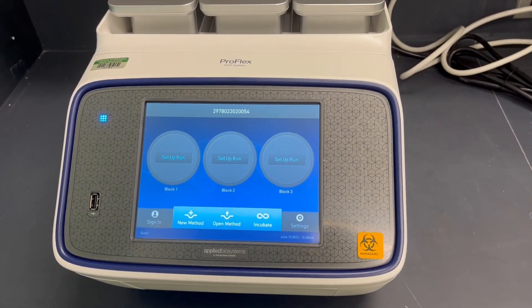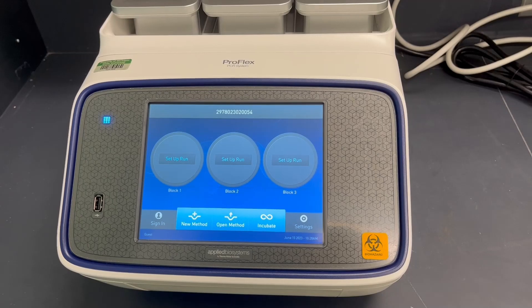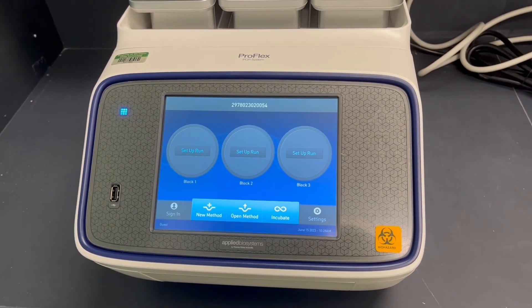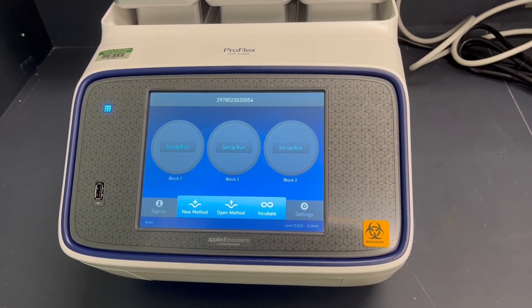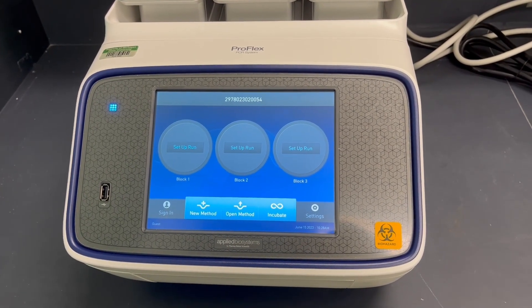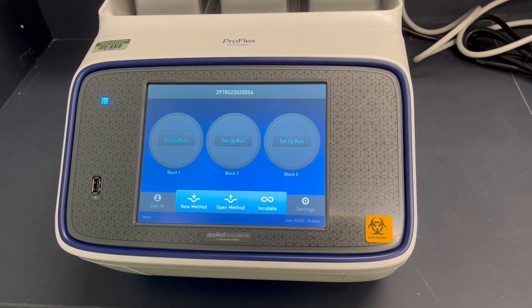Let us know if you need any help — we'd be more than happy to assist with protocol editing features if you need support. These thermocyclers also have WiFi support in theory, where you could check on your runs remotely. Because of MSU's networking protocols we haven't set that up yet, but if that's something you feel you have a need for, let us know and we can look into that.